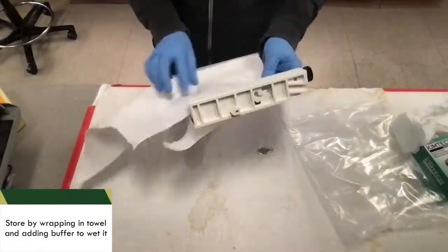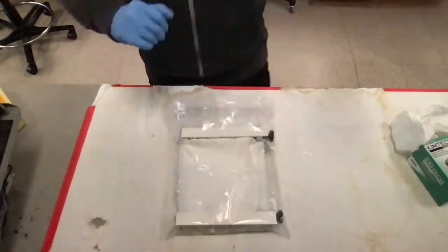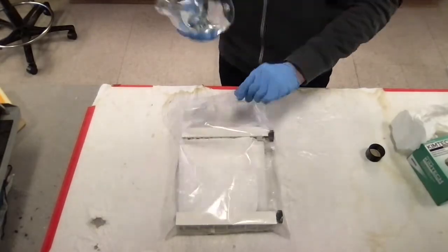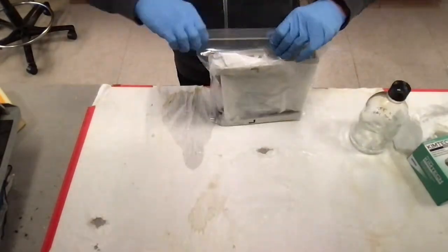And what you're going to do is wrap it up in paper towels and then add a little bit of buffer solution to keep it moist. And then you can go ahead and put it into a refrigerator.